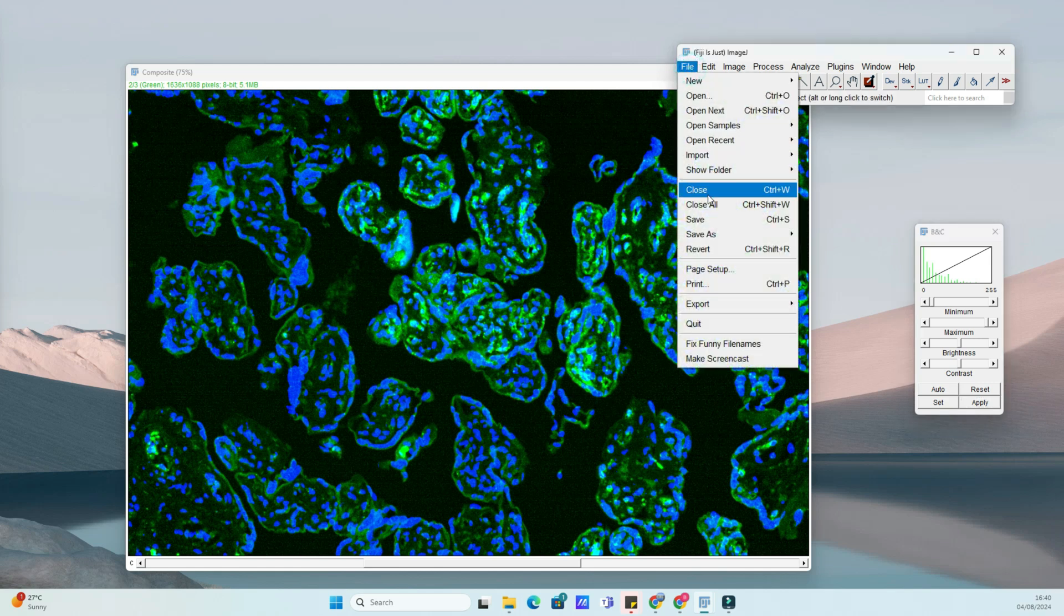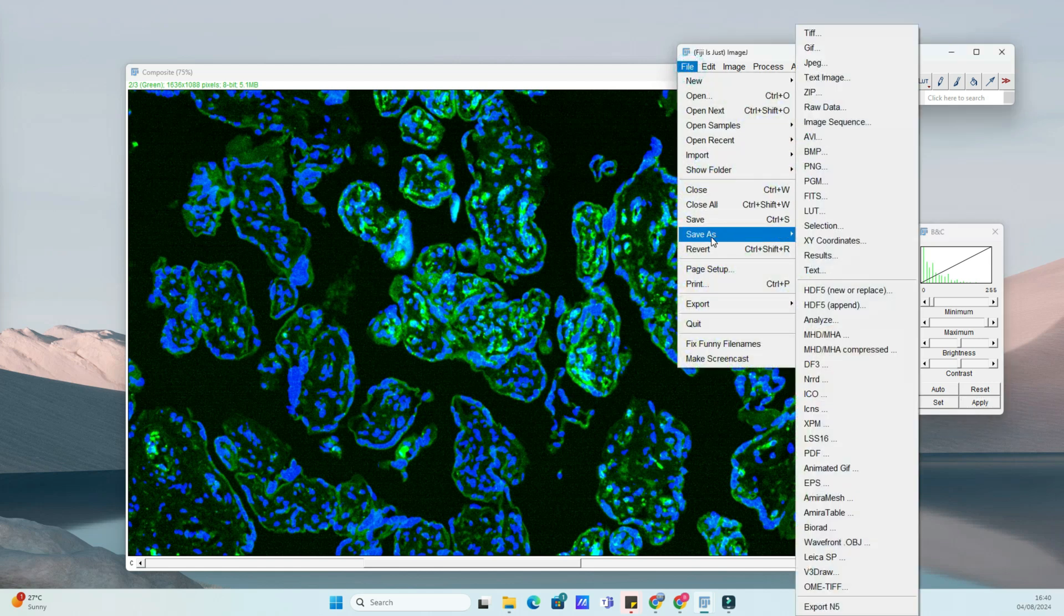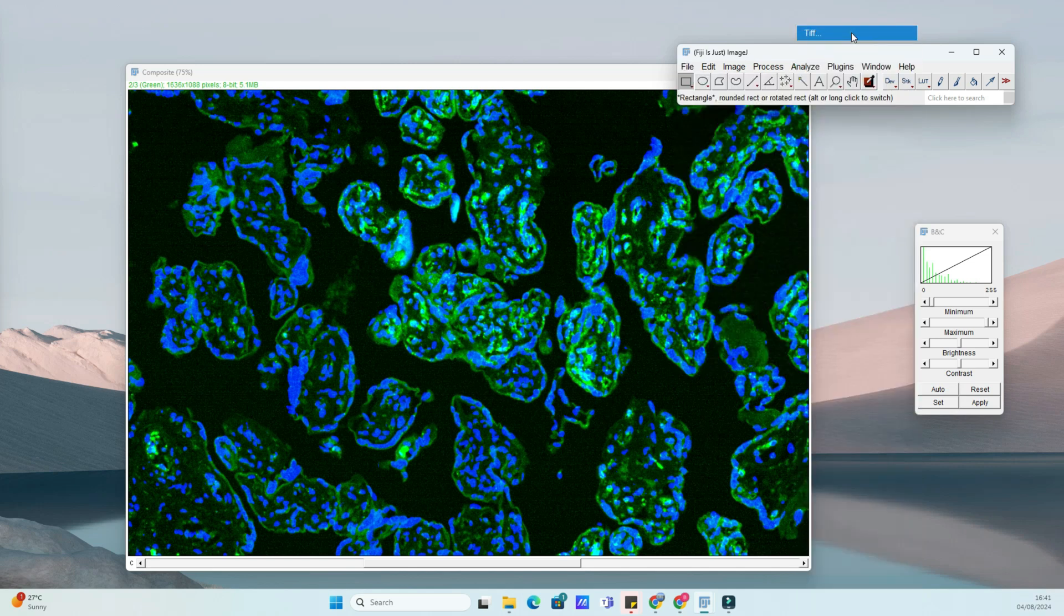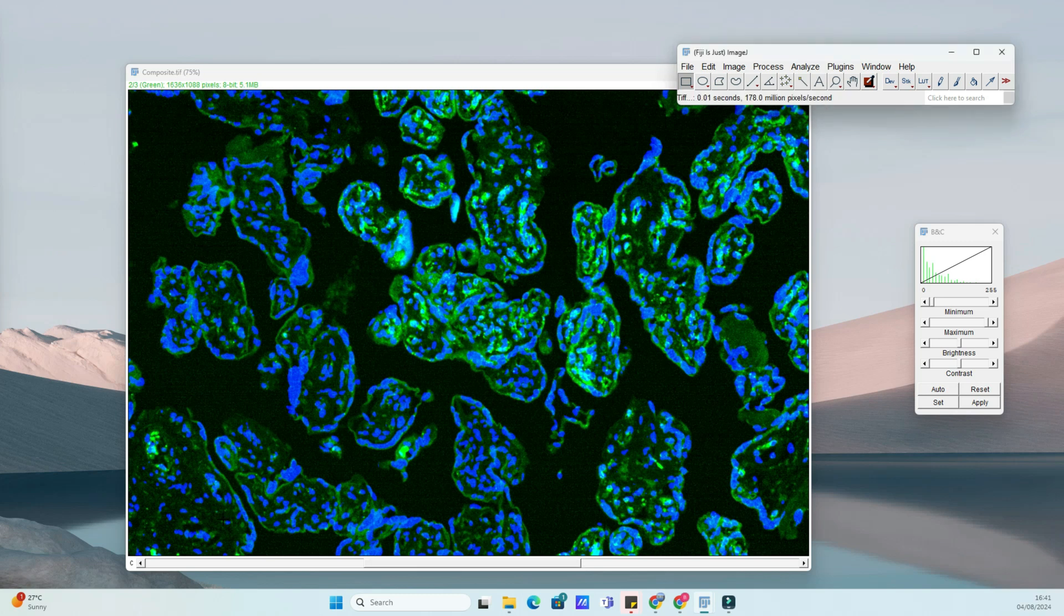You've successfully merged your immunofluorescence images using ImageJ. This composite image will help you analyze co-localization and interactions between different fluorescent markers.